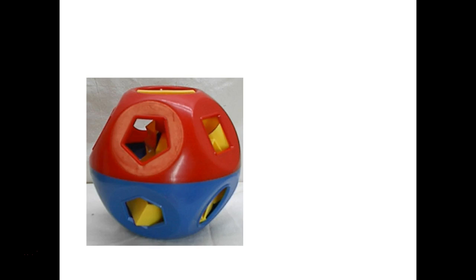But this is the same principle as crystal violet and iodine. Crystal violet went in the hole. Then iodine went in. The two of them came together, just like the little hand in the block. And so now it's trapped in there. But in the gram stain, what happens to that hole even? It shrinks. So imagine that: the little kid puts his hand in, and the hole closes on the hand. You'd really have a screaming kid and a screaming mama at that point. Forget about it.